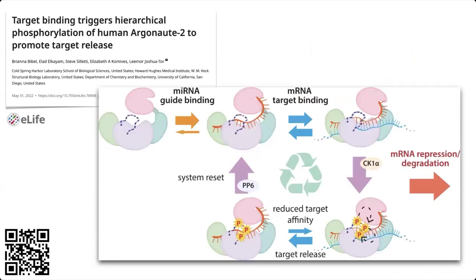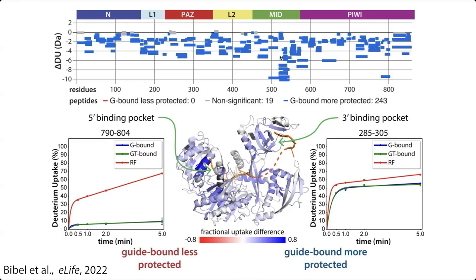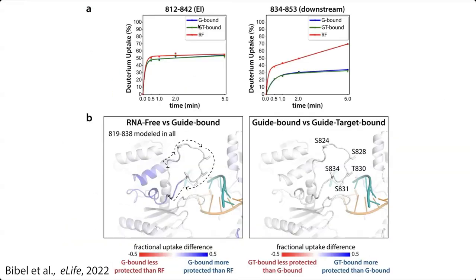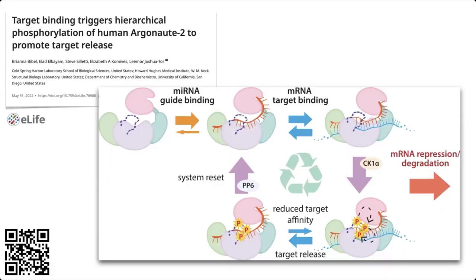And one of the techniques I used was HDX-MS. And so I'm going to tell you about how we used HDX-MS to kind of decipher part of what was going on. If you want to know more about the details, you can check out our eLife article that was published in 2022, open access so anybody can read, and I will provide a link.